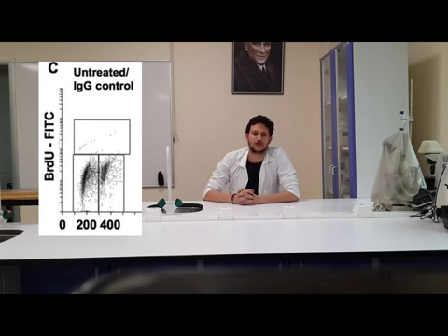Quantification of the different phases of the cell cycle confirms that TGF-beta-1 primarily inhibits proliferation in the G1 phase of the cell cycle, leading to an accumulation in this phase. Strong G1 accumulation creates essentially a single G1 peak that could be misinterpreted as G2M.